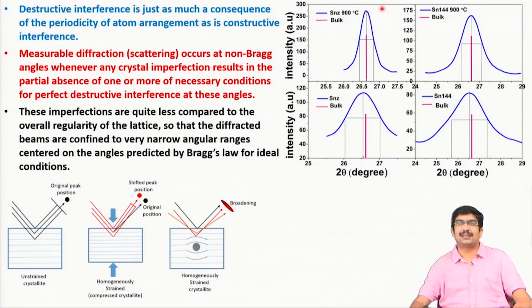The peak gets broadened; it becomes from a line function some other kind of function, maybe a Gaussian function, Lorentzian, and many other functions are there. We'll briefly discuss that, but the peaks are getting a little broader along the 2 theta axis. That is mostly the effect of imperfections on a material, and the diffraction pattern from a real specimen is all about the presence of these imperfections.